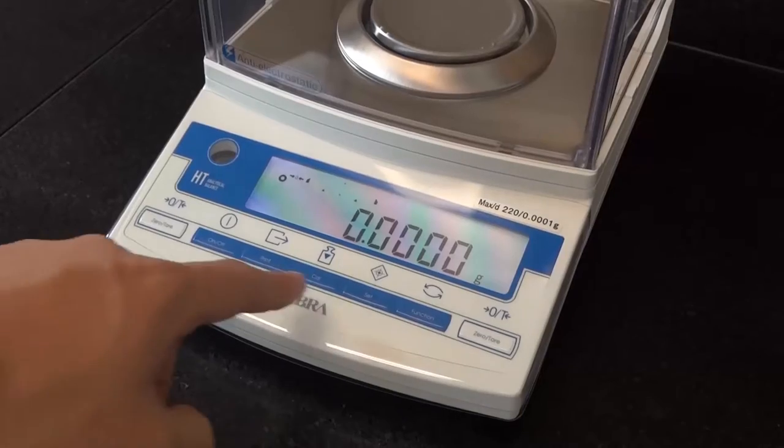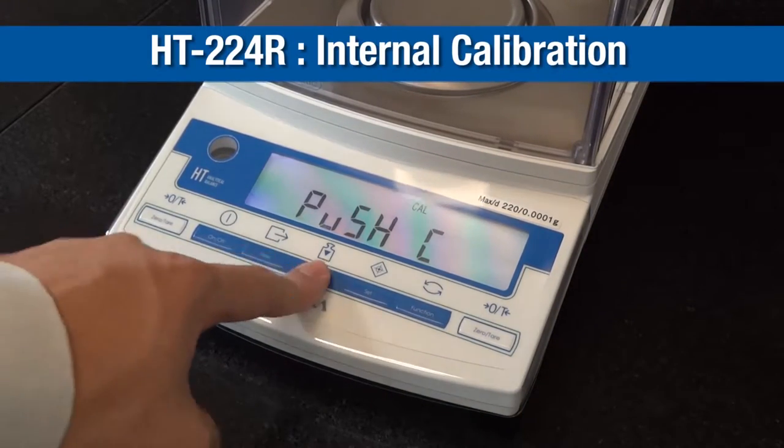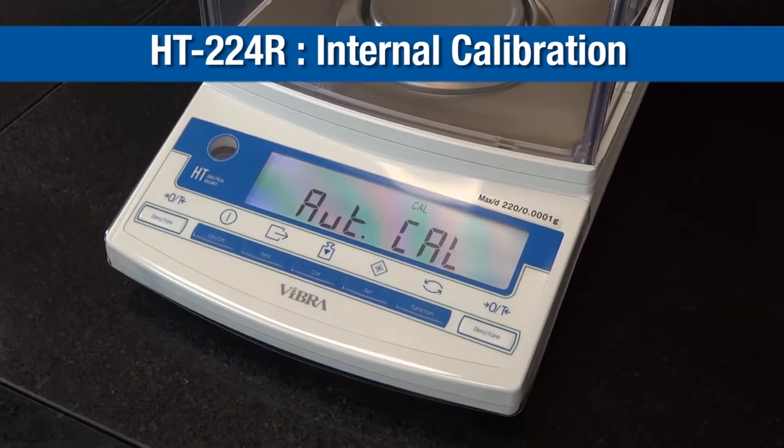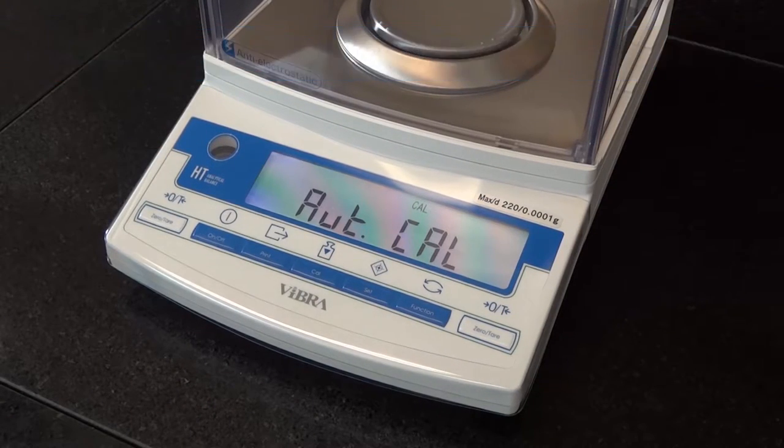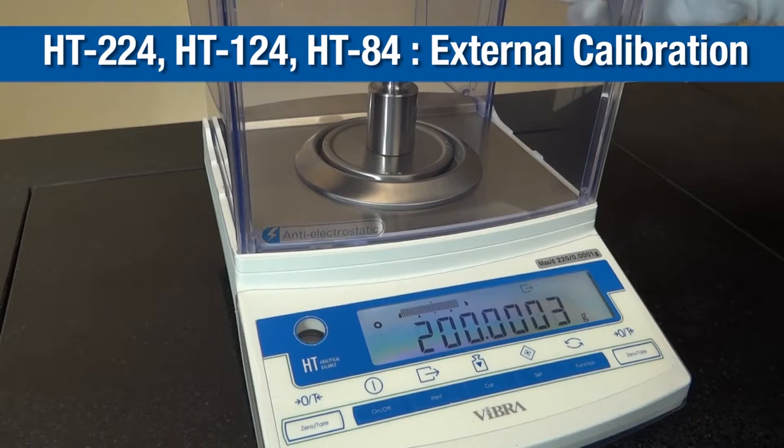The HT224R offers automatic internal calibration at the push of a button. The HT224, 124, and 84 have external calibration.